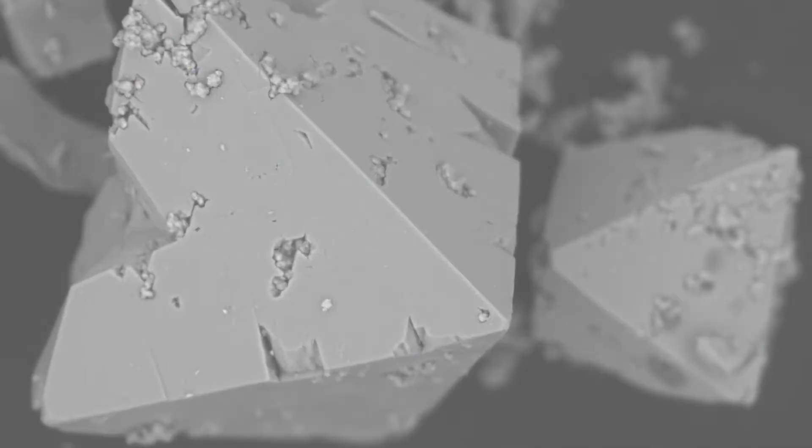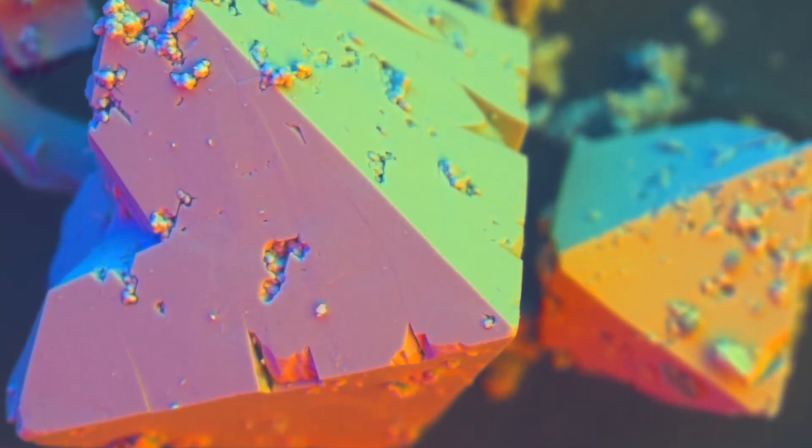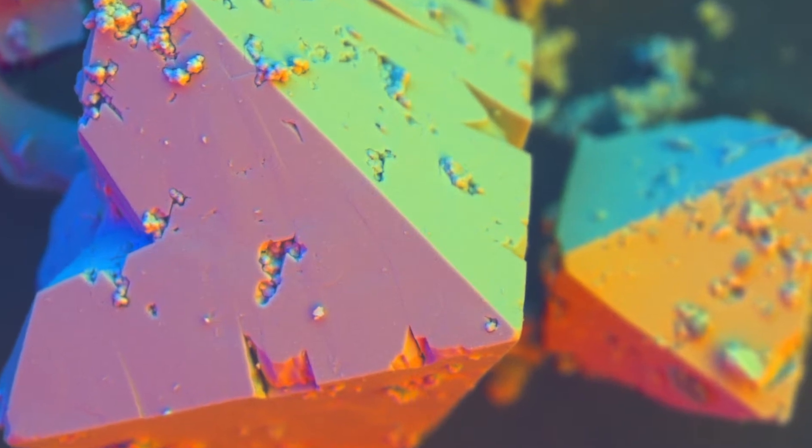Hello microscopists, this is Eric Miller from Instructonate. If you want to transform your micrographs from this into this, then stick around while I share this pretty cool colorization technique that I developed some years ago, which I call multi-detector color.